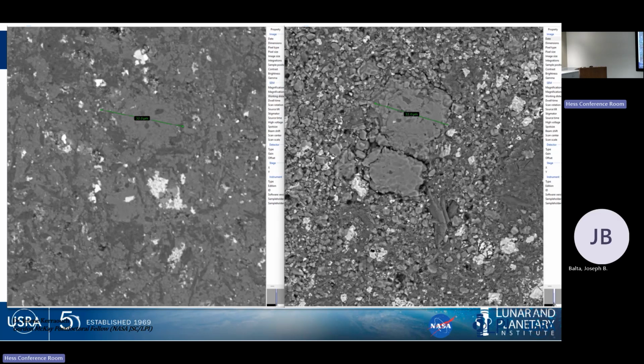If this porosity is real, and one of our postdocs is exploring this right now, this porosity could be something that we're losing the understanding of when we do a standard polishing step, where we mount everything and lock it in place. The ion milling at an angle, shooting a beam there, if there's porosity in the sample, it will preserve it in a way that we can actually see it and characterize it.